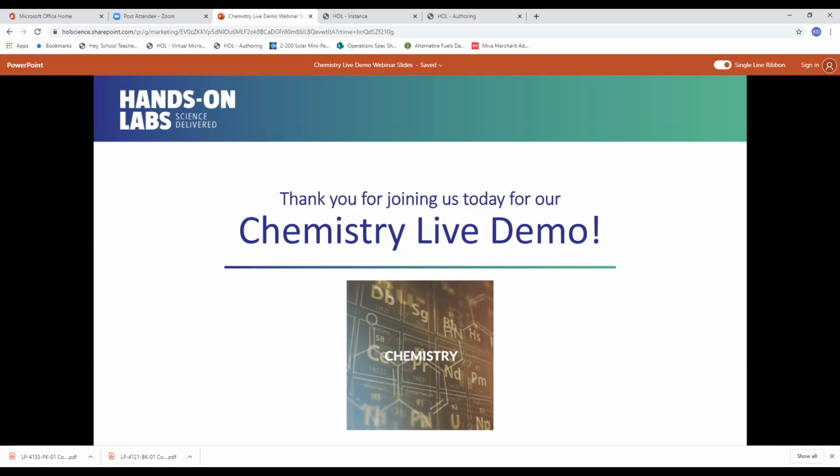Perfect. Thank you. And then we have another one about collection of data. How is mass data collected? Is there a balance provided in the kit? We do provide what we call a precision digital scale. It measures to 1/100th of a gram. That scale finds its way into most every chemistry kit, certainly all of our standard chemistry kits.